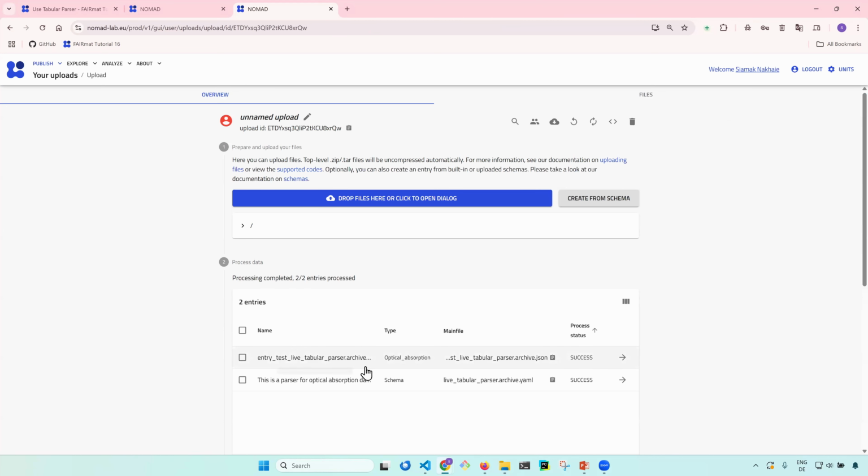And now we are able to publish them in NOMAD, or even publish and get a DOI. For instance, if you have a couple of those and you want to write a paper based on those, we collect them, assign a tag or name as a dataset, and then publish and get a DOI and refer to the dataset in our paper.